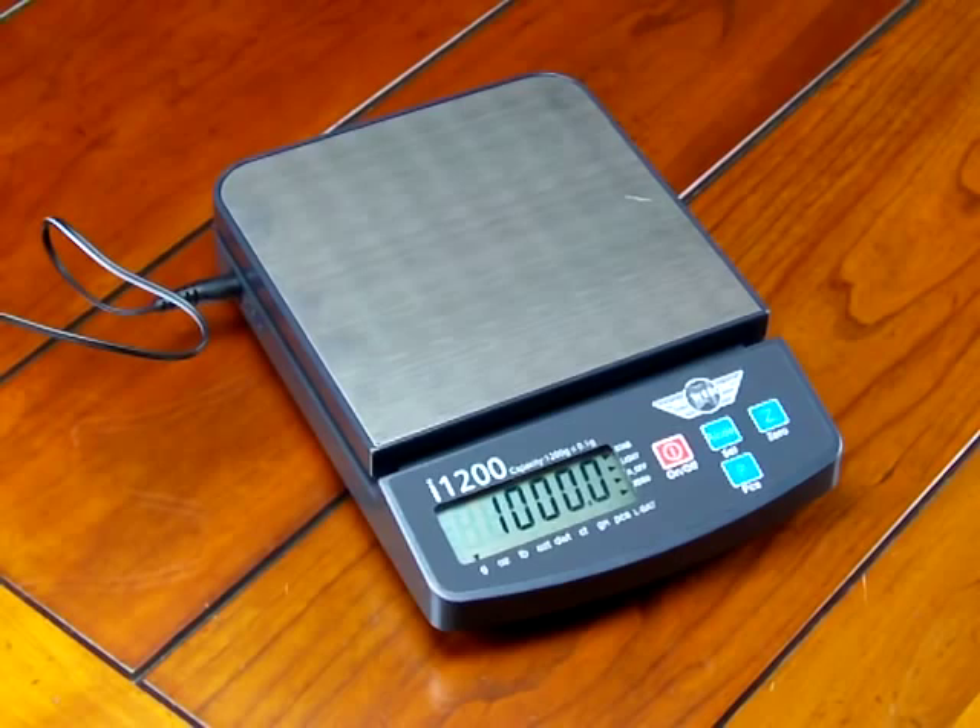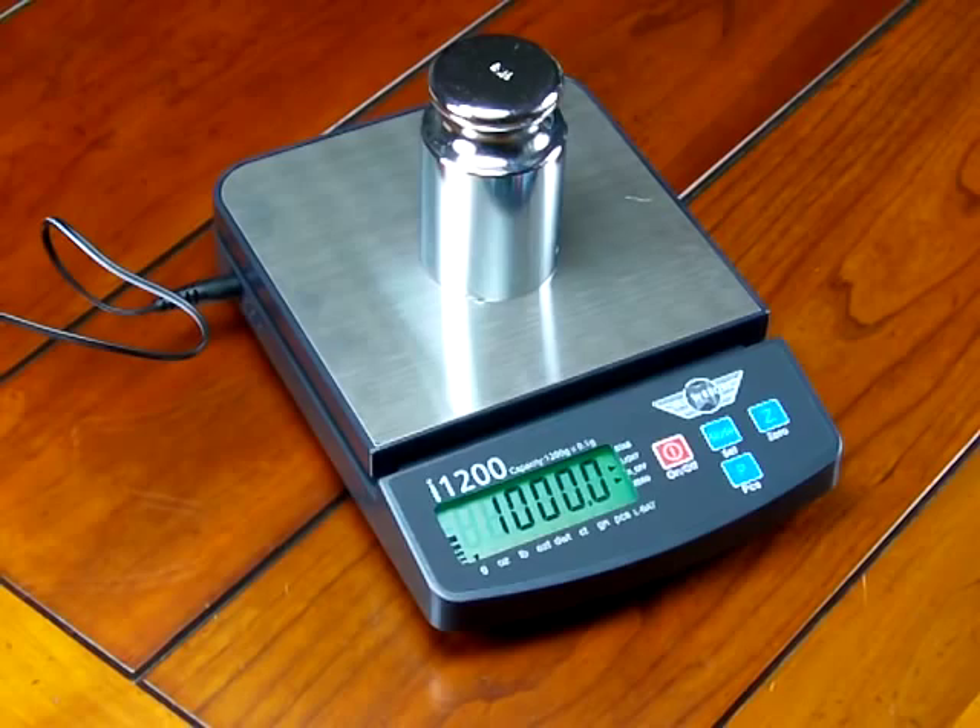Now the scale displays the calibration weight that's needed — we need a 1000 gram weight. We can do this with a 1000 gram weight, with two 500s, or with five 200 gram weights. Whatever it takes, you need 1000 grams to put on the scale. So we place the 1000 gram calibration weight on the center of the platform and press the mode set button.